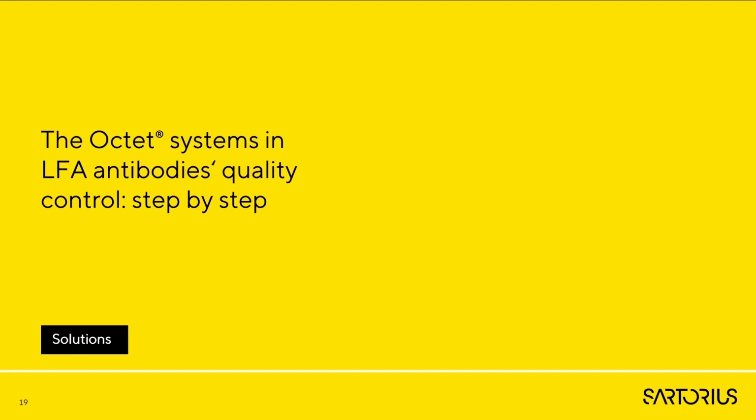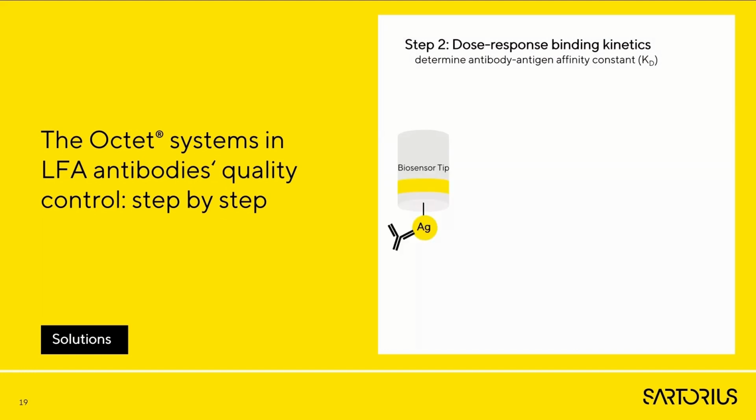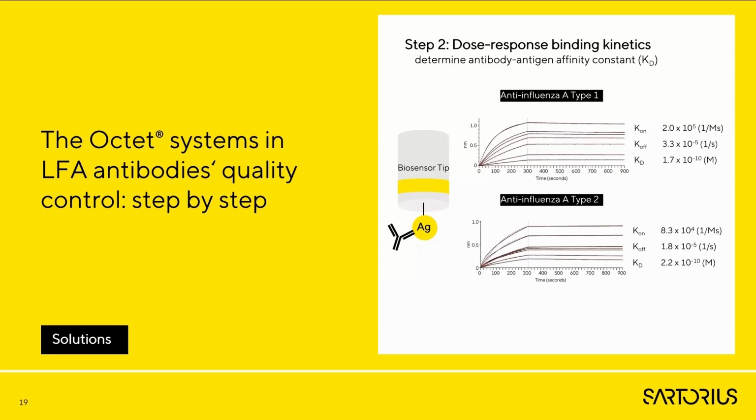The dose-response binding kinetics can be checked in the next step. With immobilized antigen on the biosensor tip and a titrated concentration series of two kinds of influenza A antibodies, we perform the binding kinetics assay. Both antibodies show high binding affinities with antigens, which ensures the stable binding of the antibody-antigen complex during the lateral flow. Type 1 antibodies show a higher binding on-rate. It results in a faster test time, which is critical in time-sensitive tests.